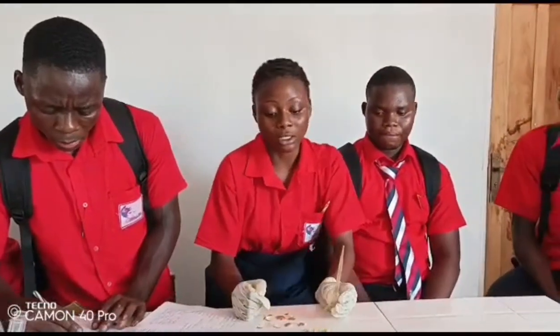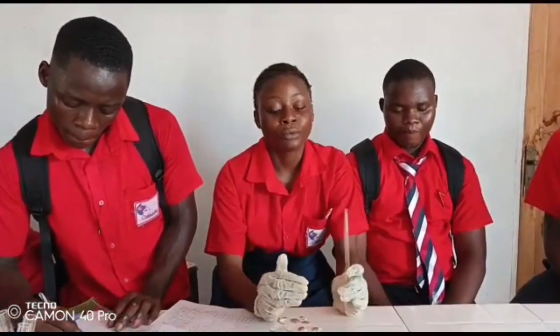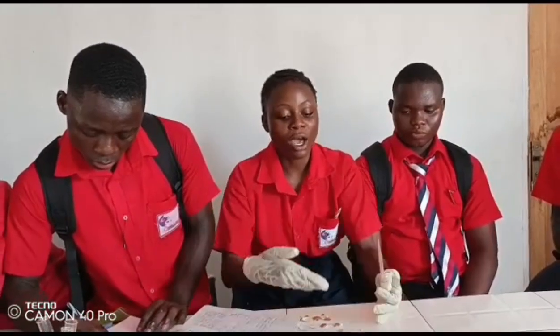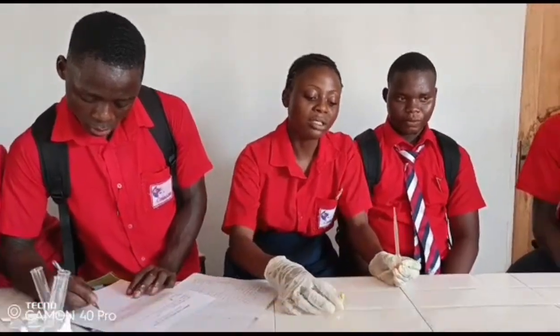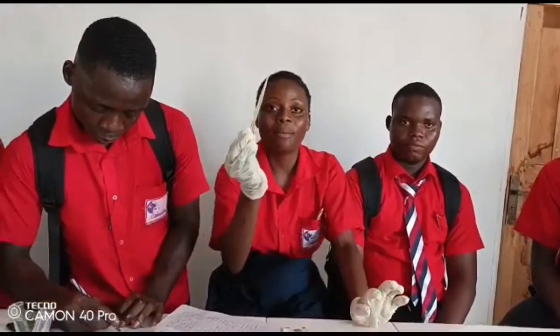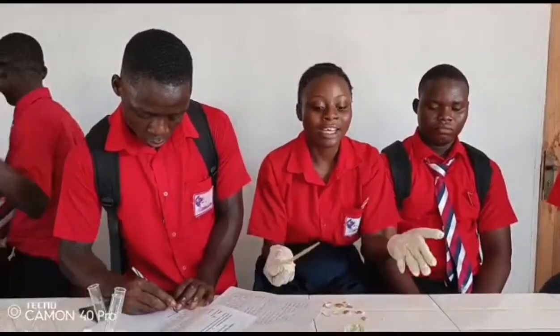Thank you. I'm student Tabitha Ravina Adams. In today's lab class, we came to detect the starch in food. Our lab instructor asked us to bring egg to detect if egg has starch. While we were doing our observation, we placed the egg on a petri dish, and this is the paper. We transferred the iodine onto the paper to detect if egg has starch or not.